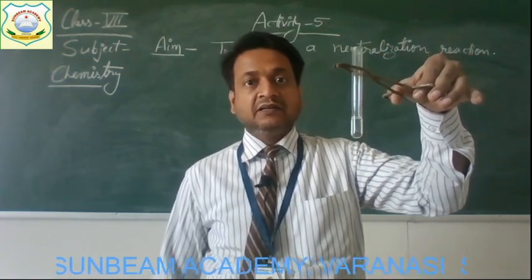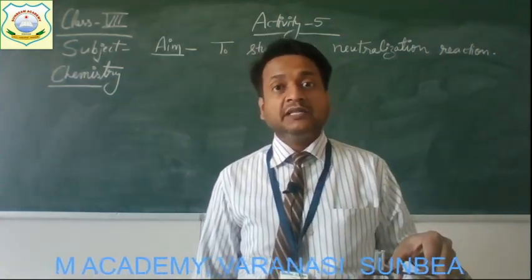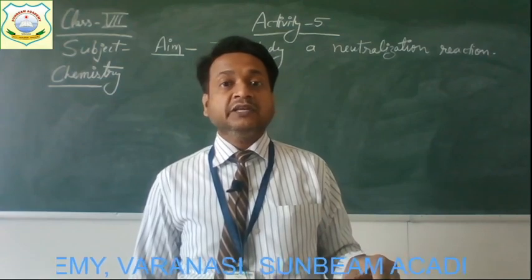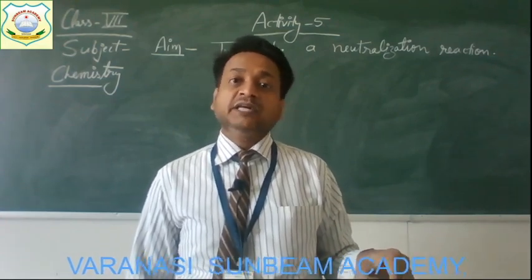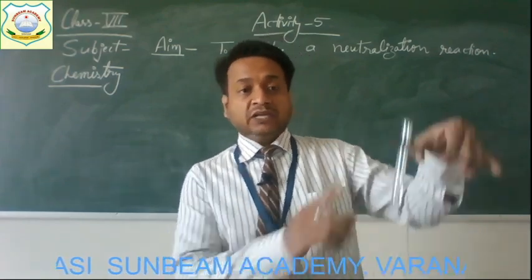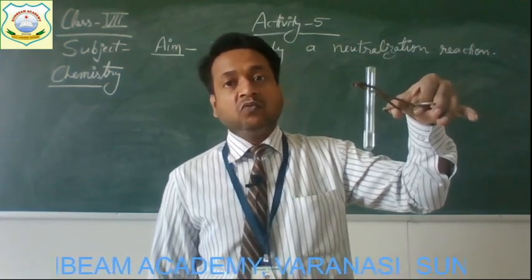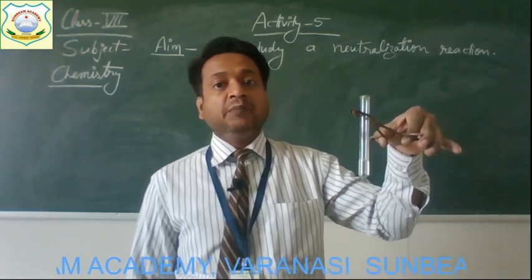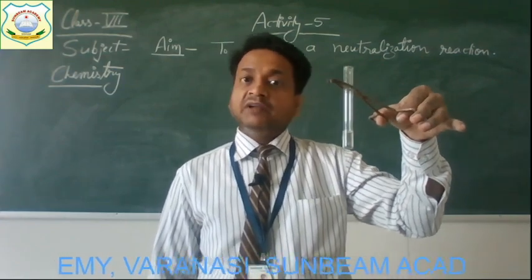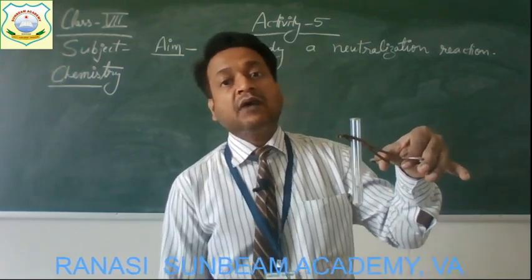Got it children? This time a chemical reaction takes place between the acid, hydrochloric acid, and the base, which is sodium hydroxide. Due to this reaction, two products are formed, that is sodium chloride and water. So actually this is a solution of sodium chloride salt and water. If we want to obtain the sodium chloride salt, we will heat this solution. After heating for some time, the water present in it gets vaporized and our salt will be left.